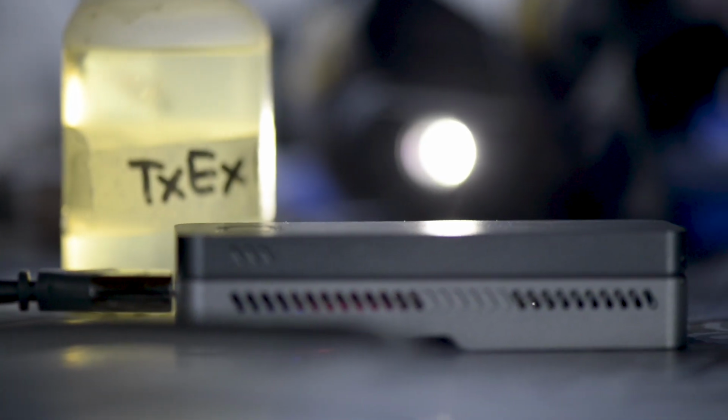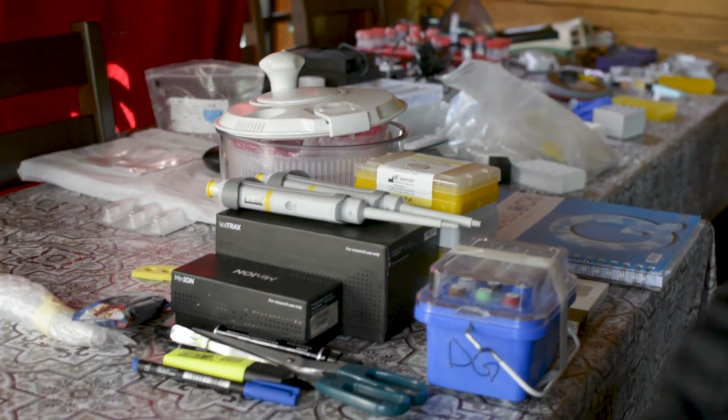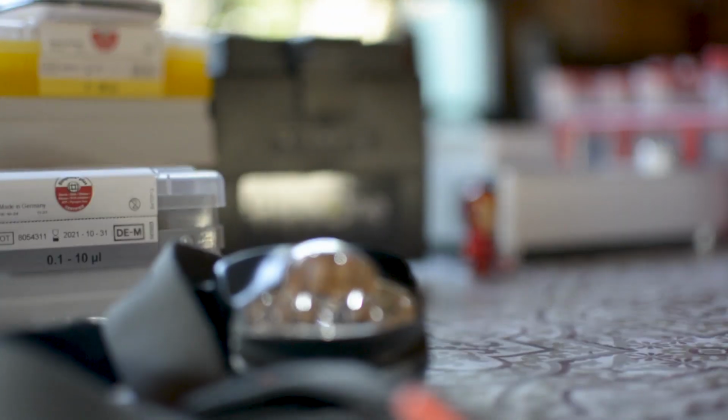The sequencing technology is quite similar to the computing technology. Now we can bring them with us, with laptop, tablet, or telephones. And we can bring the DNA sequencing technology anywhere, also in places like this, helping taxon expedition and other scientists to characterize biodiversity.